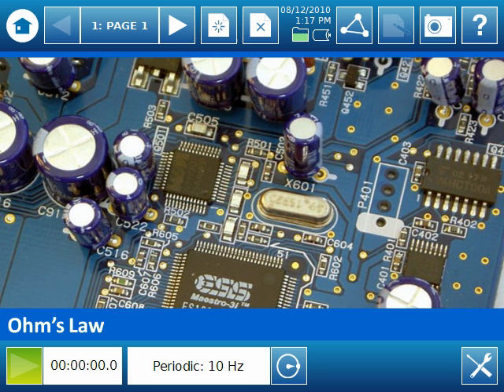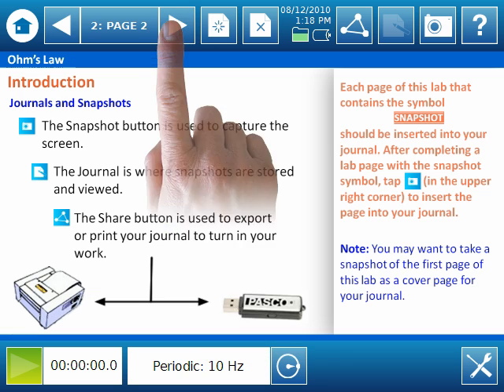The activity automatically loads to the first page. For those Spark Labs that come with your Spark Science Learning System, this is going to be a title page. To navigate through the pages in a Spark Lab, use the right and left arrows at the top of the screen.